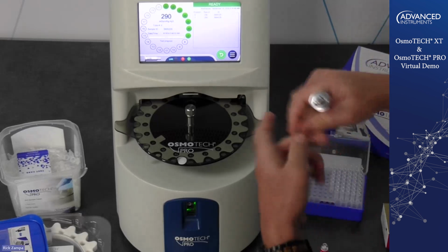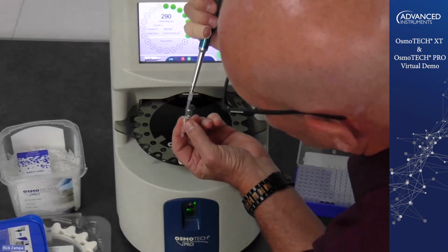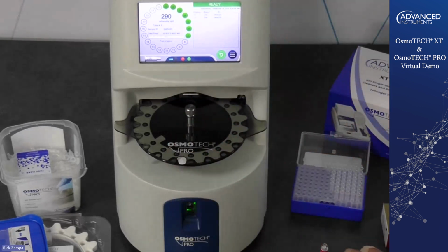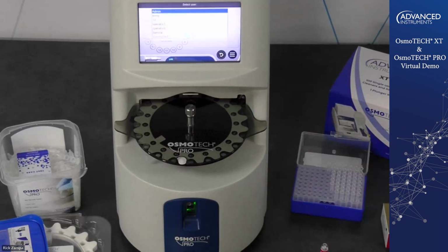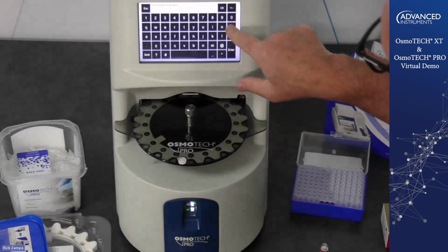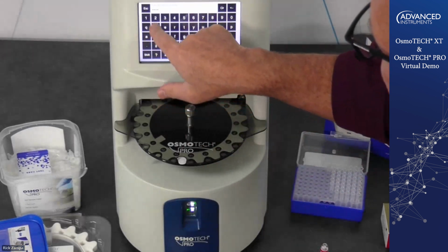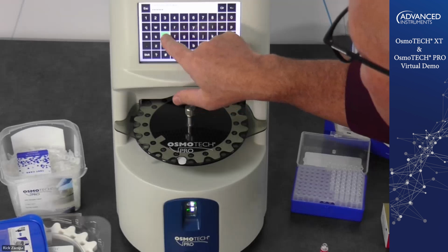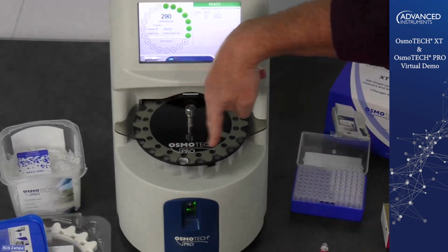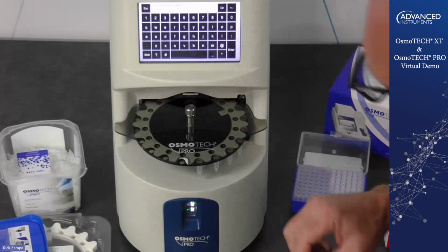All right, I'm going to pipette my 30 microliters into the bottom of my sample cup. All right, I have my 30 microliters. I'm going to hit my start button here. And you can see it brings up a screen, asks me to log in. So I'm going to log in as the administrator. Hit enter. It's going to move the turntable around to the next open position, which was position 8.